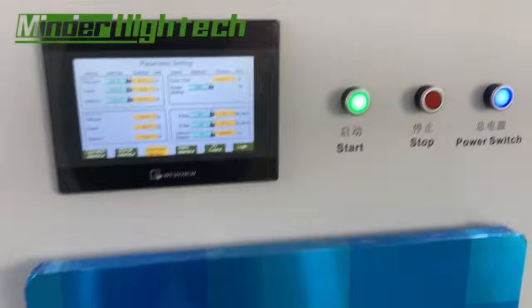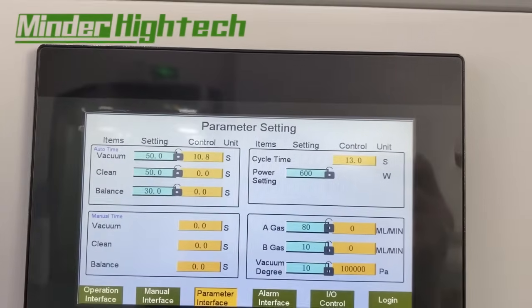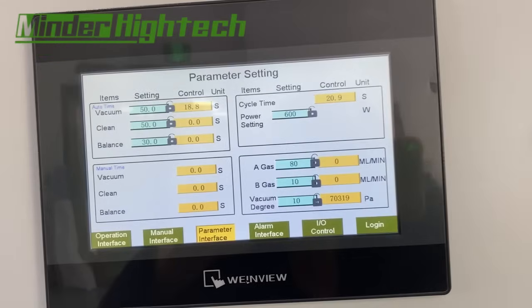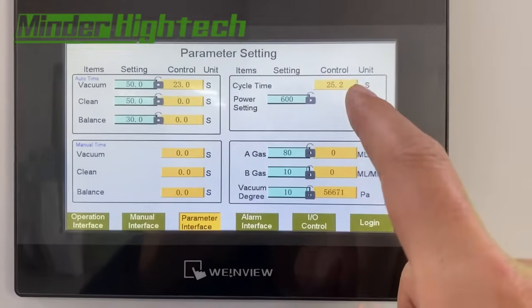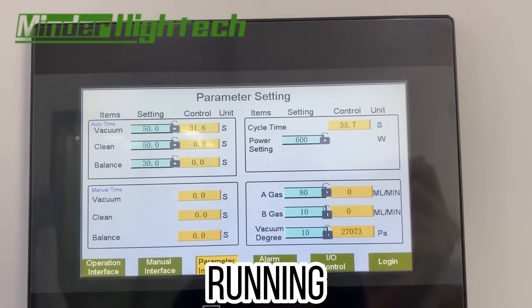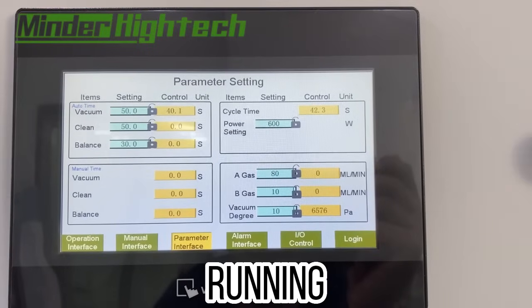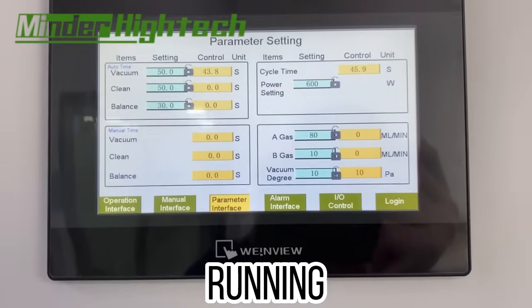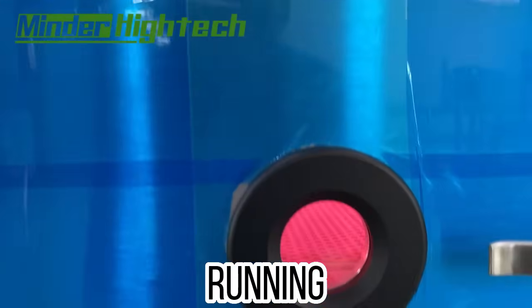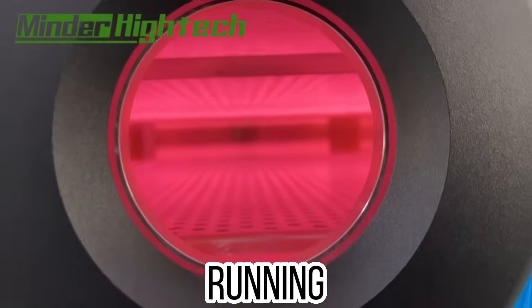Press start and the vacuum process will begin. Vacuuming normally takes about 50 seconds. The yellow bar shows the real-time status. After vacuuming completes, it moves to the clean time phase — you can observe the inside of the chamber.